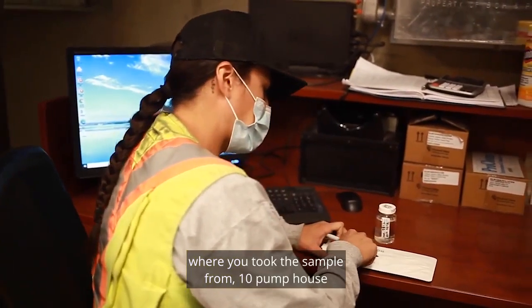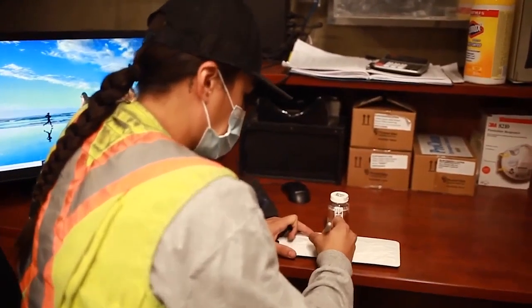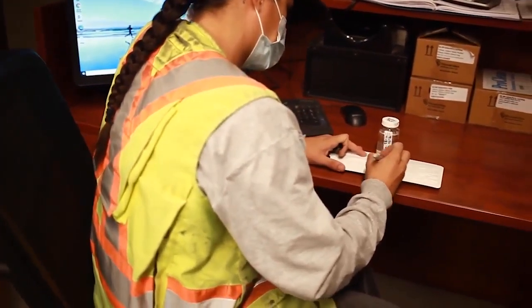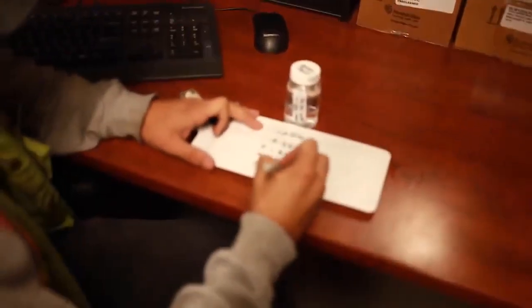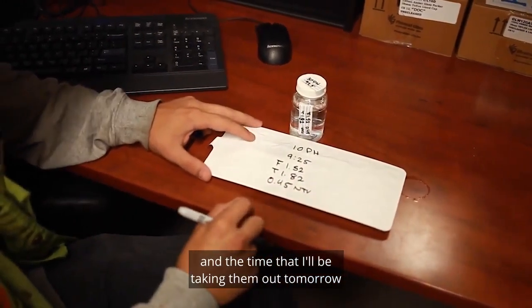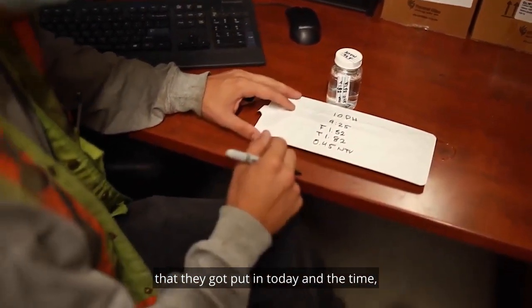Where you took the sample from — Kent Pump House — what time you sampled, how many samples in total. I also put today's date and the time I'll be taking them out tomorrow, just in case I'm not here and somebody else needs to know when to take them out.